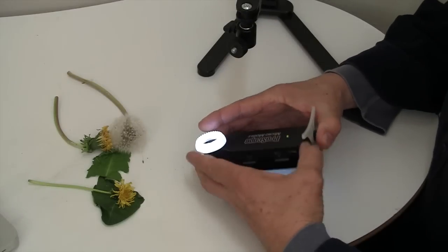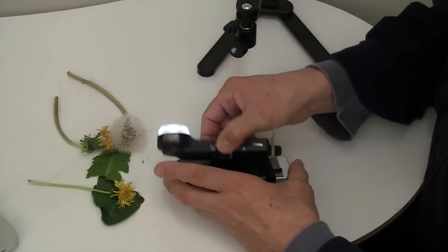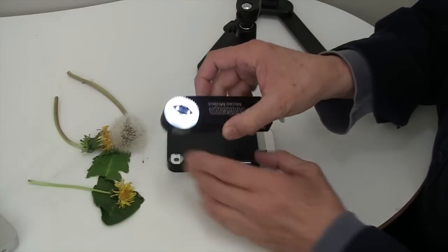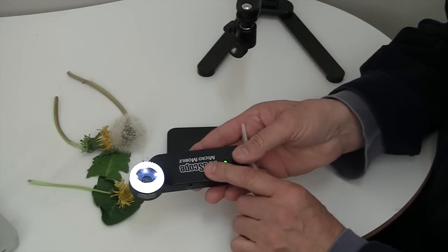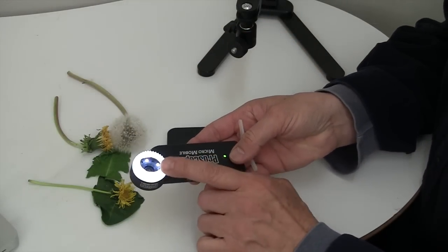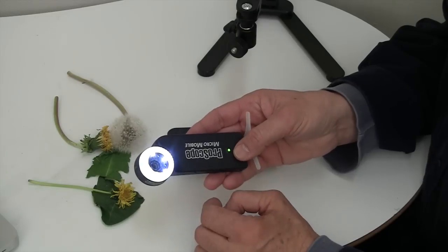Using the ProScope Micromobile, I can take it off the main sleeve like this. So I'm left with my lithium ion polymer battery, white LEDs, and of course the lens.